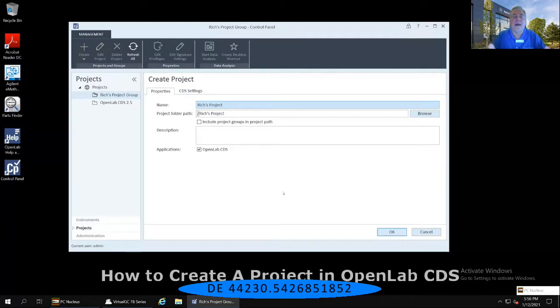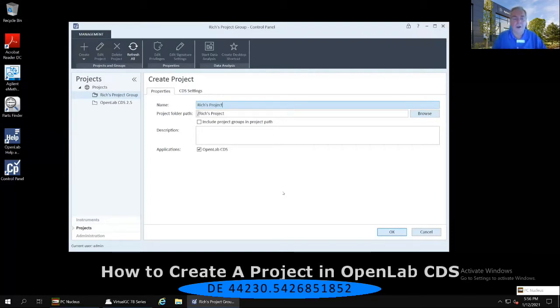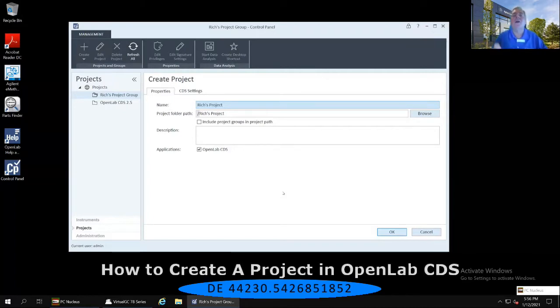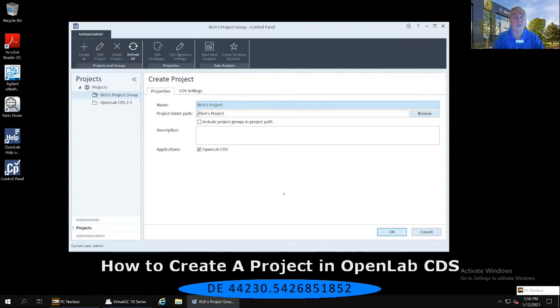But if you attempt to do that on either the beginning of the project name or the end of the project name, all of those types of special characters, including things like the space bar, or let's say the ampersand sign, or the number sign, those all call upon a database to do a certain type of formula. Since all we are doing is creating names to projects and project groups, that doesn't make sense in this context, and it will not allow you to create that project with those special characters either at the beginning or at the end.